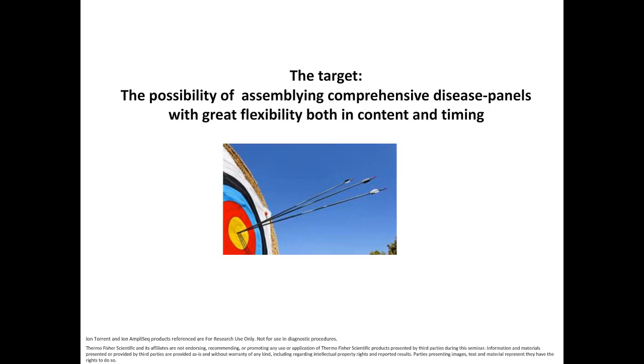Well, I've insisted on that in my presentation, but generally speaking, the Ion Torrent system is tailored to the need of a single lab and is the answer to whoever has the need of doing next generation sequencing in, let's say, a clinical research situation where the data need to be translatable and actionable immediately.